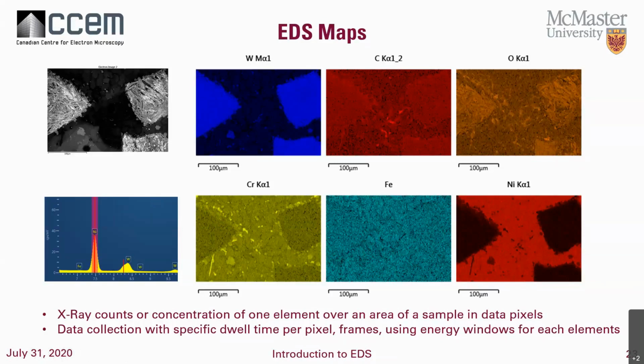Now, this can sometimes be a problem based on what kV you're using. In this case, we're using enough energy. We're using 15 kV, so nickel should be properly optimal. So we should be getting good counts there.